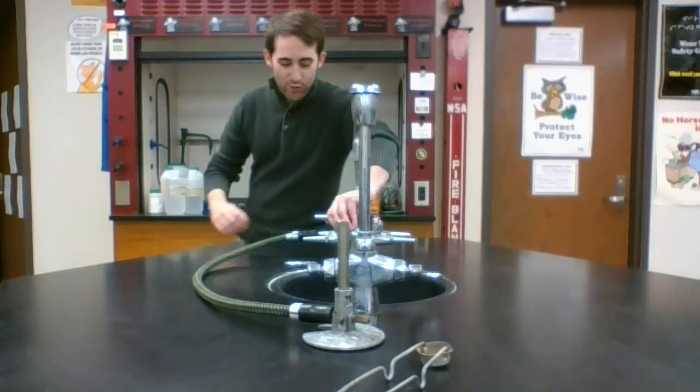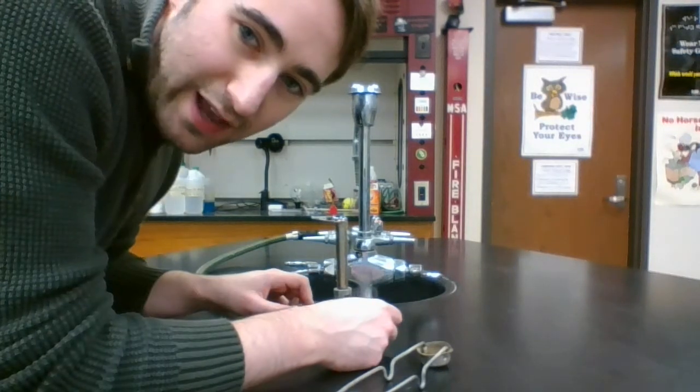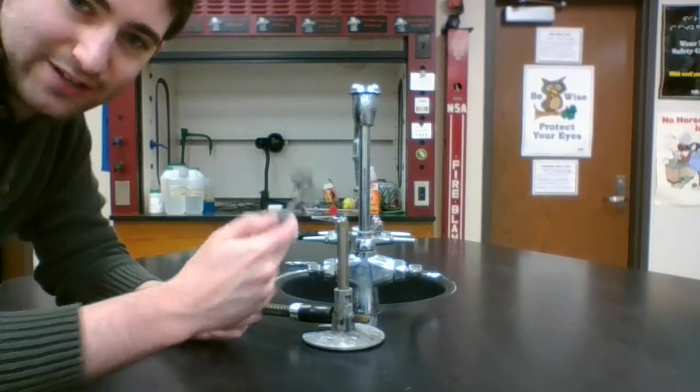I point the valve towards the hose. That means the gas is flowing. I can hear a slight hissing noise as the gas is coming out. Okay, I just have to light the gas.